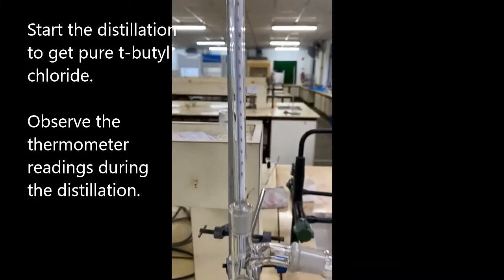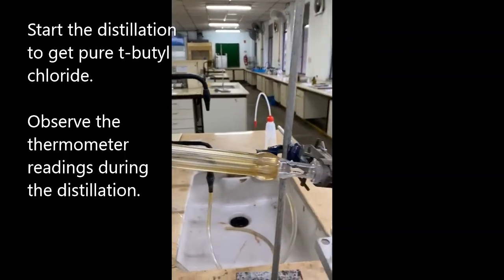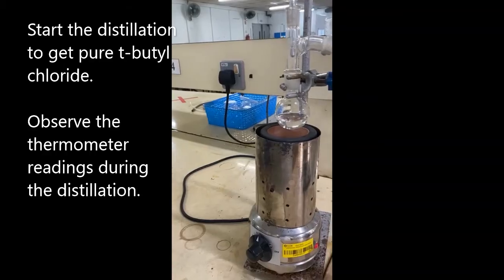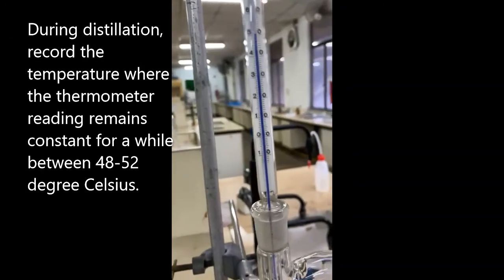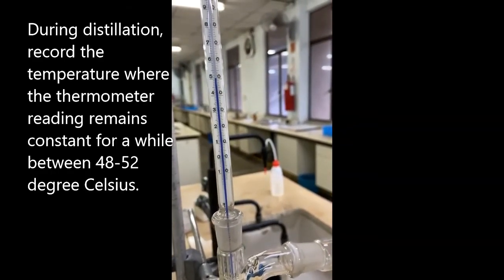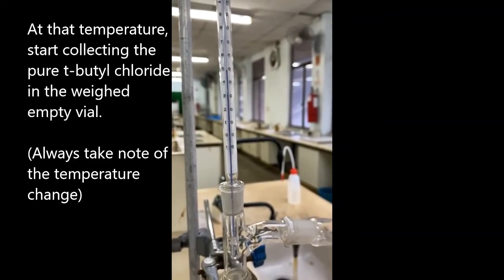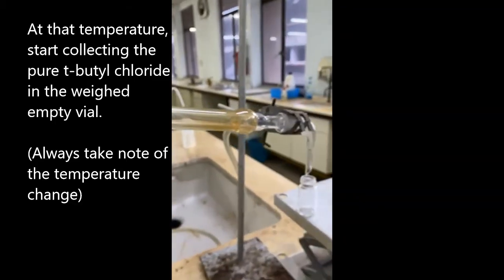Switch on the thermal heater to begin the distillation. Observe the thermometer readings during the process. This is when the temperature on the thermometer settles between 48 to 52 degrees Celsius. At this temperature, the purified tert-butyl chloride begins to flow into the pre-weighed empty vial.